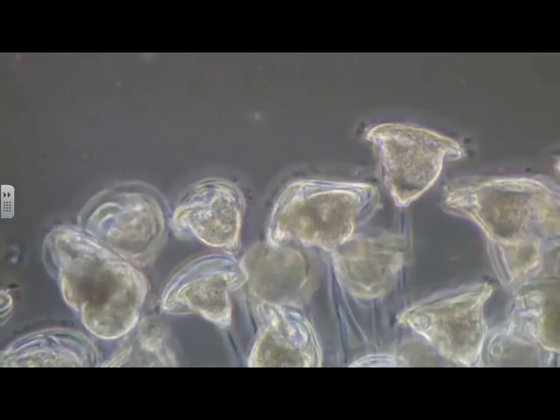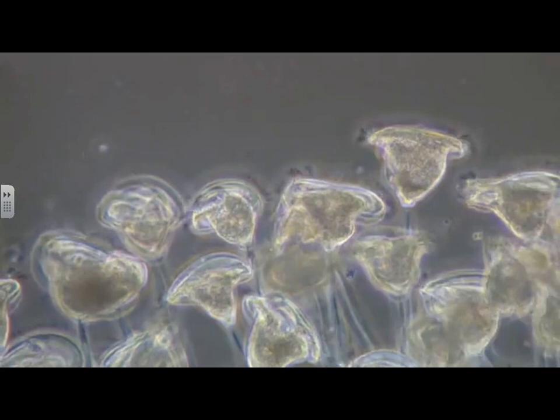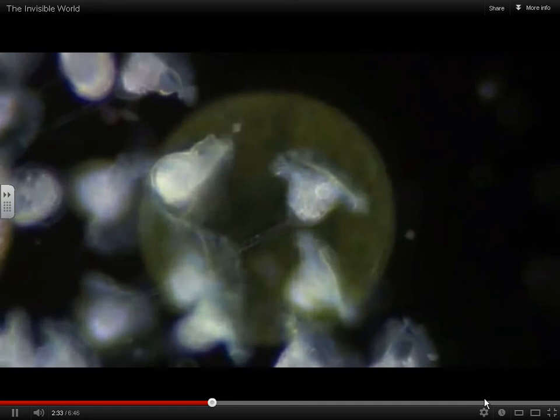Now, these are called vorticella. If you notice, they have little hairs called cilia that help to bring food into their body. Isn't that cool?